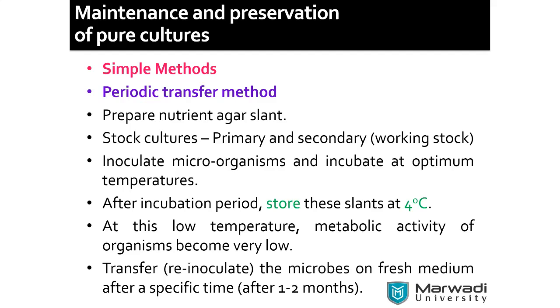Okay, chances of contamination because of surface area. Okay, fine. Yes. So it's a concern with the surface areas. When you are opening the plates, there is more chance of exposure to the air.